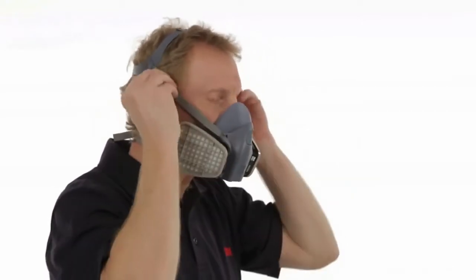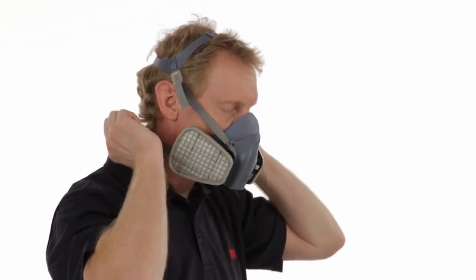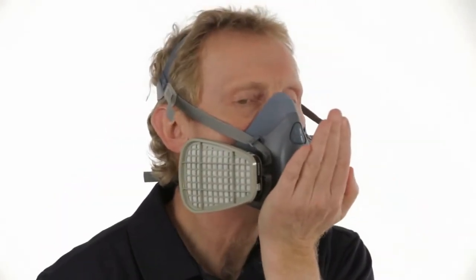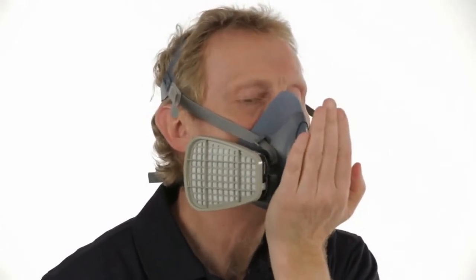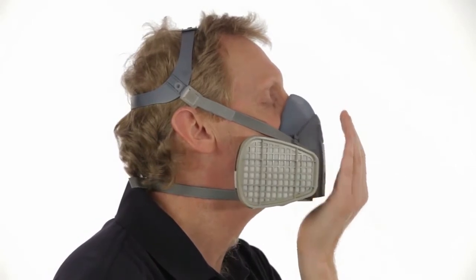To perform a positive pressure user seal check, place the palm of your hand gently over the exhalation valve cover, being careful not to apply too much pressure and disturb the face seal. Exhale gently. If the facepiece bulges slightly and you feel no air leaking between your face and the face seal, your respirator has sealed properly to your face.